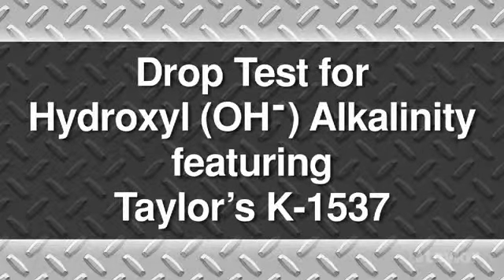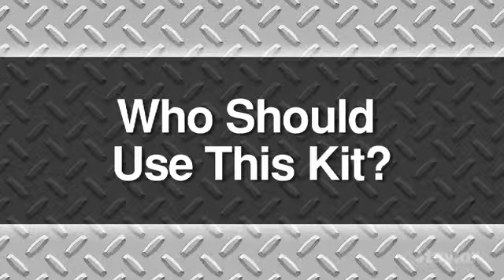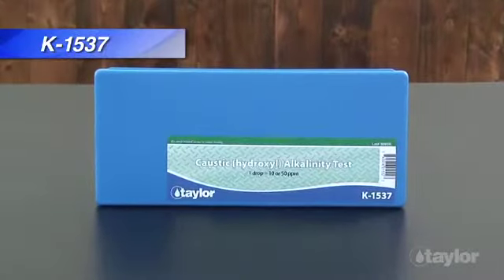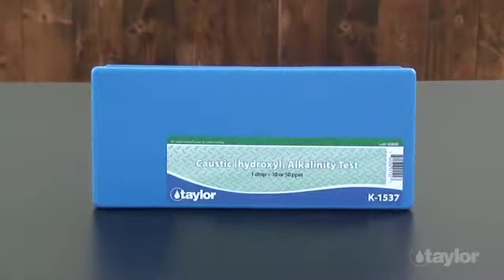Drop test for hydroxyl OH alkalinity featuring Taylor's K-1537. Who should use this kit? Testing for hydroxyl alkalinity is an important step in water treatment programs.